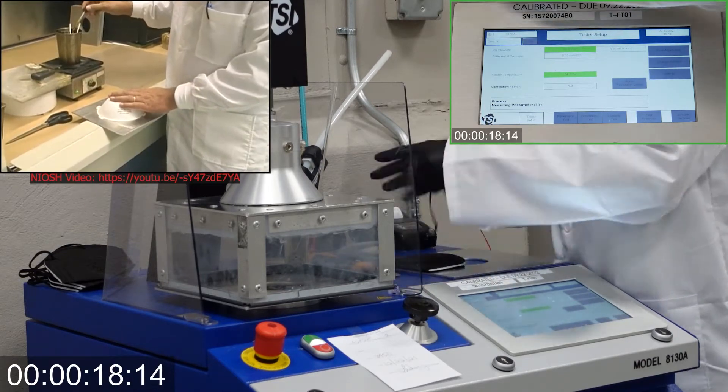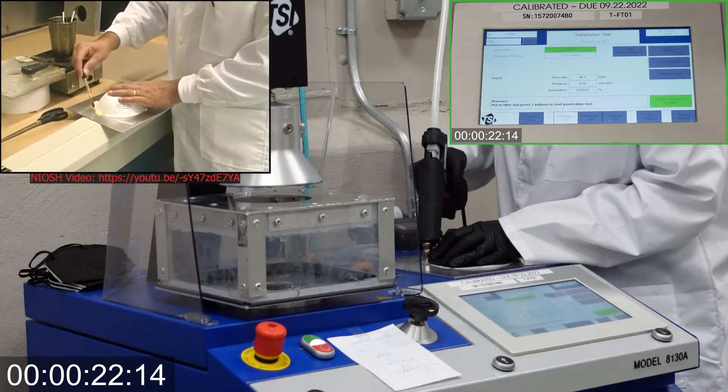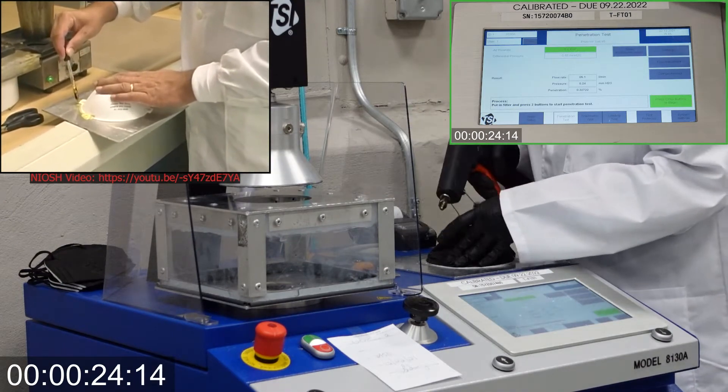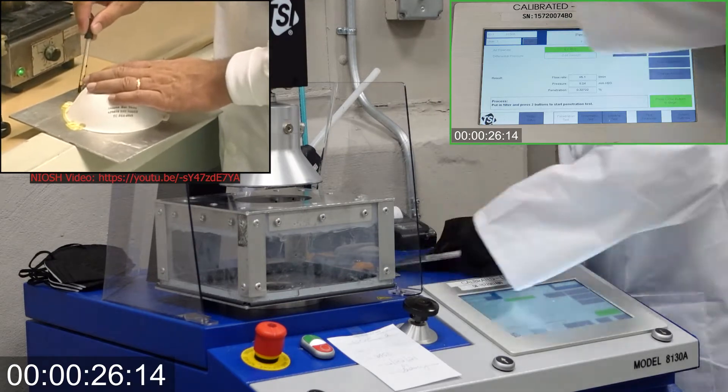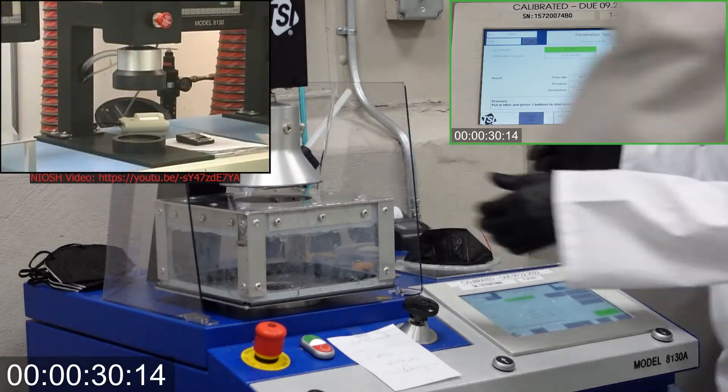First, we make sure the mask or respirator is properly and completely sealed with beeswax or hot melt glue to the testing plate as seen in the NIOSH video. The testing plate is then attached to the frame.